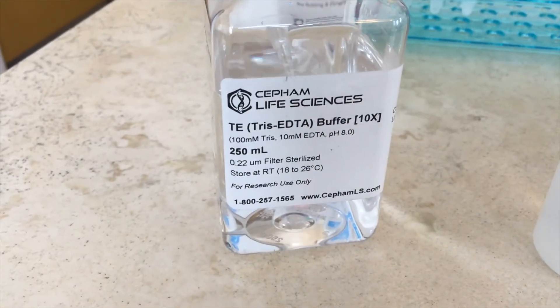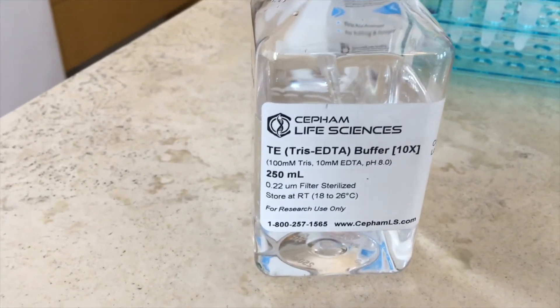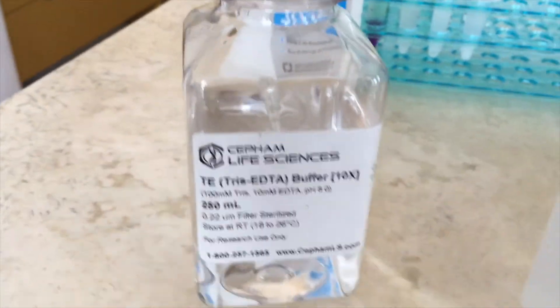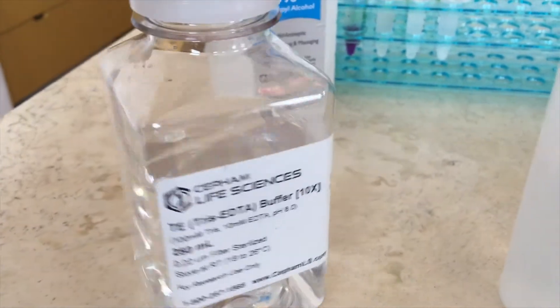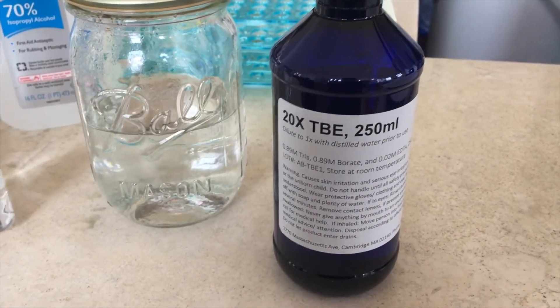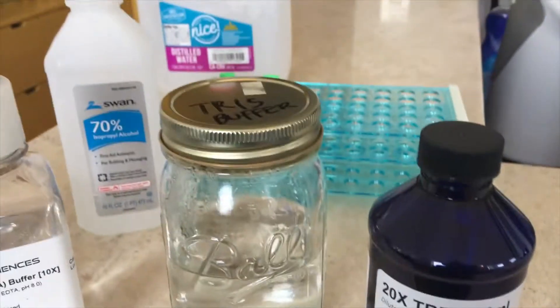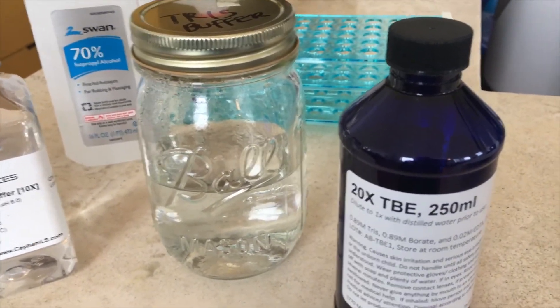You're going to need some Tris EDTA buffer 10x — it's a very specific item. I bought it on Amazon, but you can also buy it in other places online; it's all on the equipment list attached to the video. This one's a little bit more expensive, but you're going to use very minute amounts of it so it's going to last you a very long time. You're also going to need 20x TBE, which is another kind of Tris buffer, and you're going to dilute it 20 to 1. I keep it in the fridge — you don't actually have to — but that's used for the gel electrophoresis.